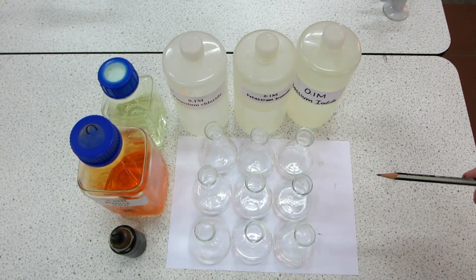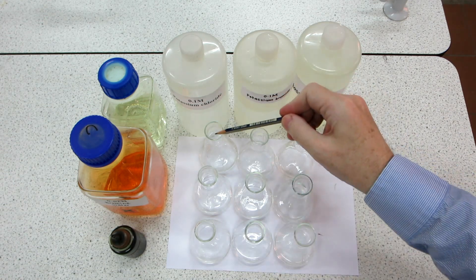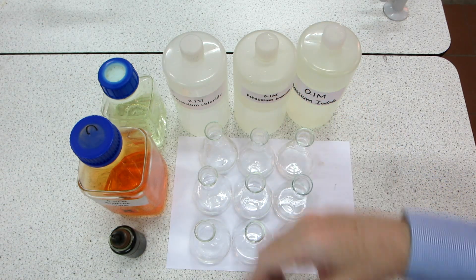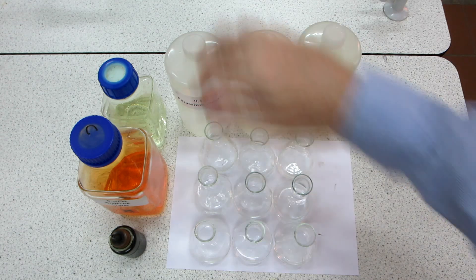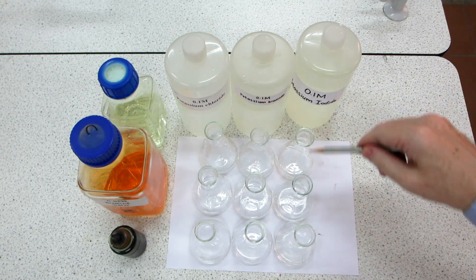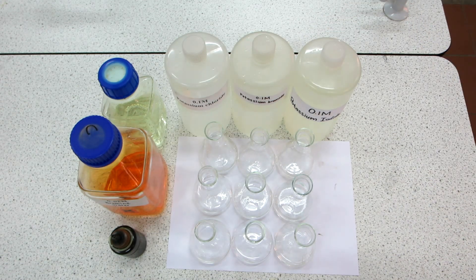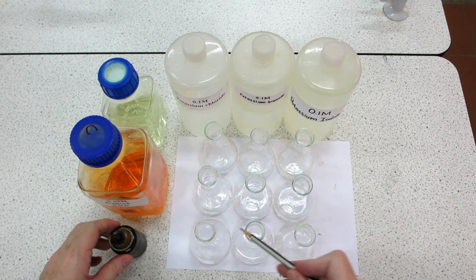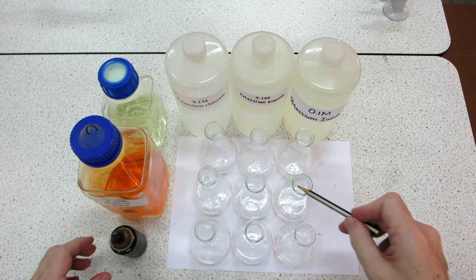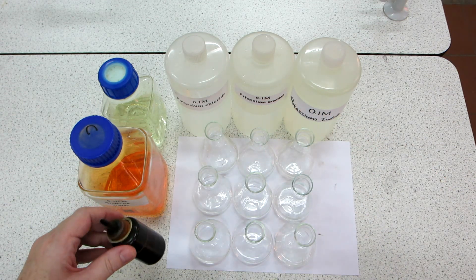Here we are with a series of halogen halide iron displacement reactions. In the first three conical flasks we have potassium chloride, in the second three conical flasks we have potassium bromide, and in the third set of three conical flasks we have potassium iodide. Into each of them we're going to sequentially put iodine in this row, bromine water into this row, and chlorine water into this row. Let's have a look if any displacement reactions occur.